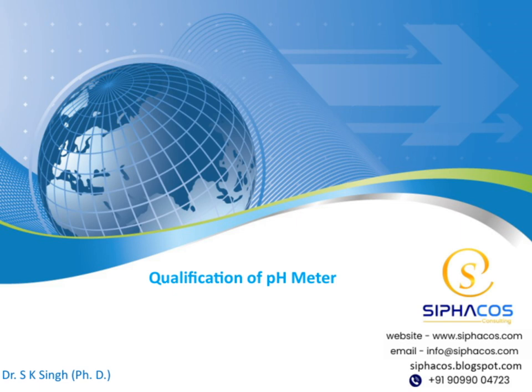Today, we will be discussing the qualification of pH meters, an essential topic in analytical chemistry. The focus will be on understanding how pH meters are calibrated and maintained for accurate measurements. We'll cover the basic principles, the proper procedures, and some best practices. So, let's get started and explore this important subject together.